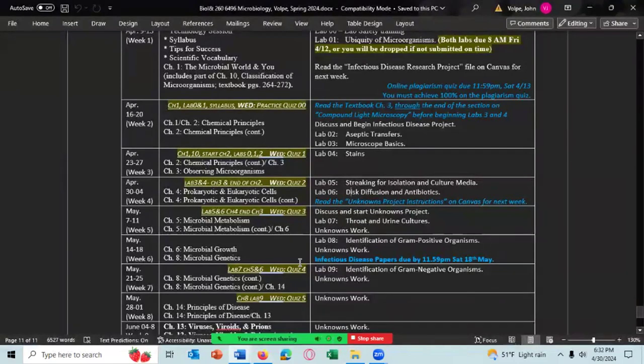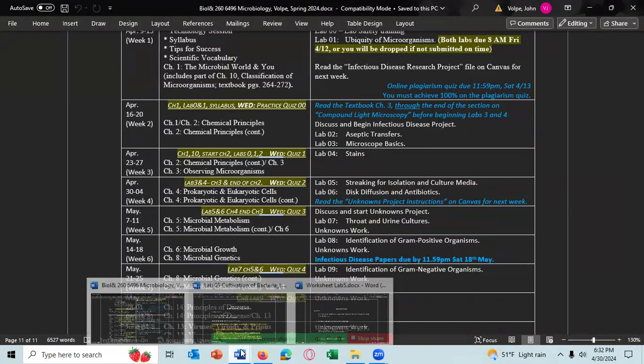So today is April 30th, and we should be covering Lab 5, Streaking for Isolation and Culture Media. On Thursday, we'll do Lab 6, Disk Diffusion Antibiotics, and I'll tell you on Thursday to read the unknown project instructions. I'll show you where that is on Thursday. Any questions about what we're doing? If not, let's go to the lab.